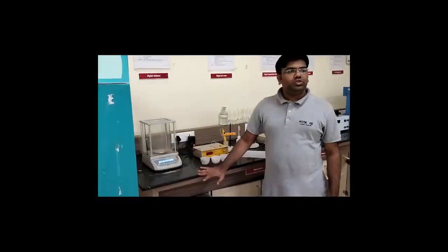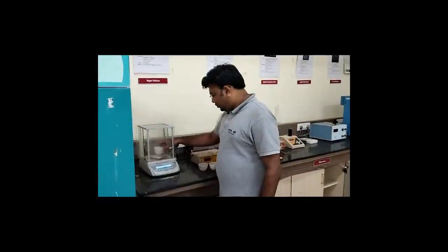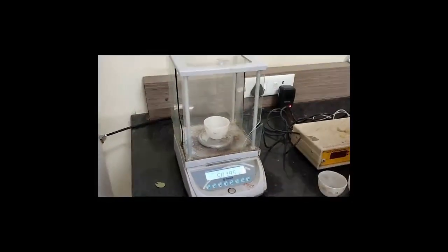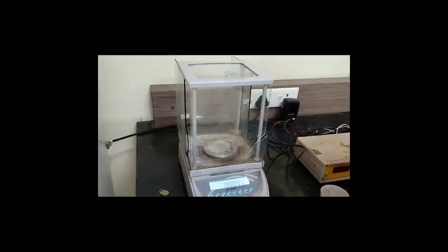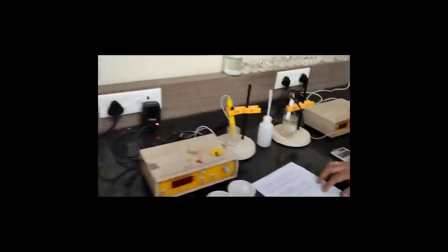Okay, we have cooled the crucibles and we have transported them near our weighing balance. Right, so what we have to do is just take the weights of all these crucibles. I'll be taking the weight of only one crucible, and I'll be telling you the different weights that we have recorded previously. So let's go with this C crucible. The weight of this crucible is 50.195 grams. Similarly, we have previously taken the weights of all our crucibles A, B, C and D, and here you can see the weights have come in this manner.